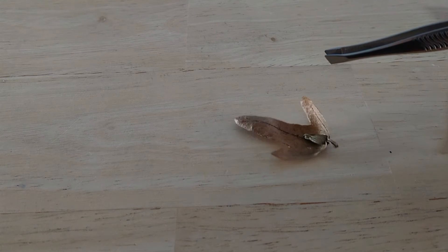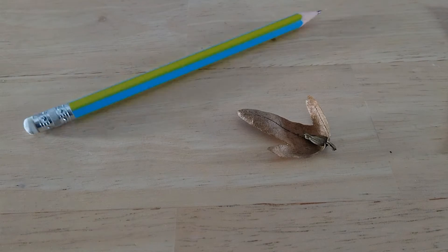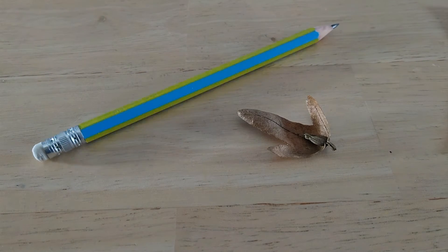Hello ladies and gentlemen. Today I found this leaf. We're in the northern hemisphere, so it's winter — fall passed already a long time ago. I can give you a pencil here so you can have an idea of the scale we're working with.